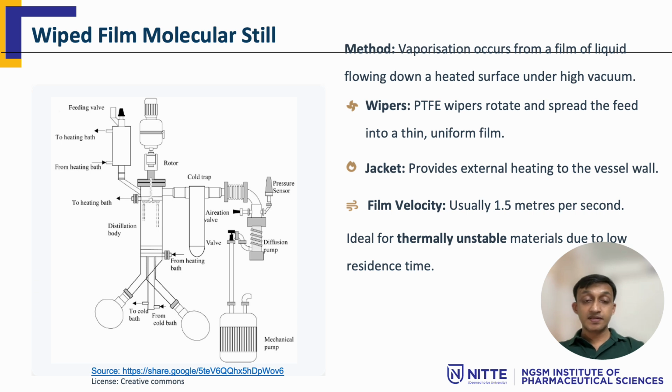In this system, the feed liquid is introduced into a heated cylindrical surface. Now, instead of allowing the liquid to remain stagnant, the system uses rotating wipers, typically made with PTFE or other inert materials. These wipers perform several important functions.